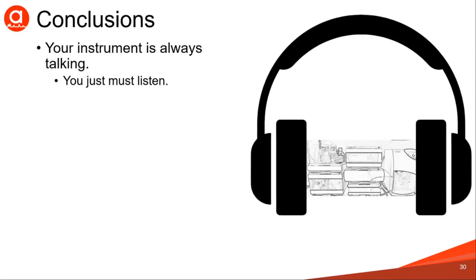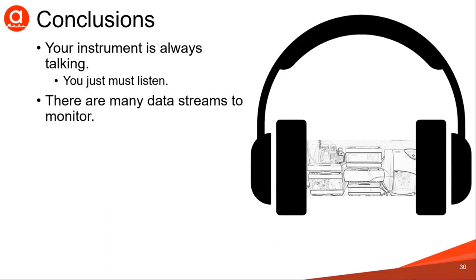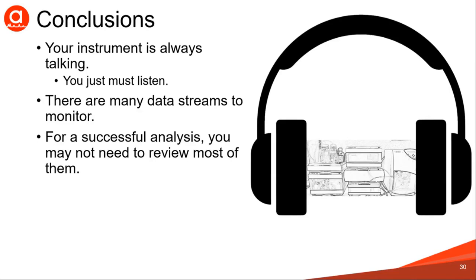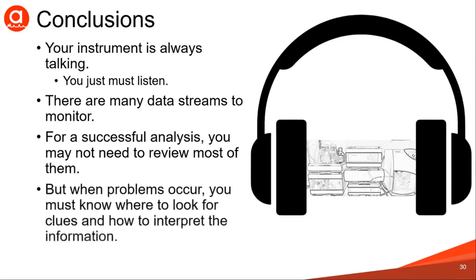So we can wrap up this talk by just reminding you that your instrument is always talking. You just have to listen to it. There are many data streams to monitor, and in most successful analyses, you won't need most of them. But we want to have them available because when problems occur, you must know where to look for clues and how to interpret that information.